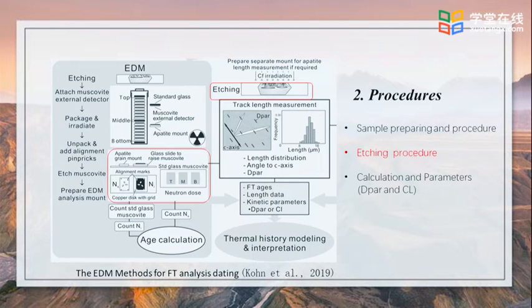After irradiation, the external detector is etched to reveal an induced fission track mirror image corresponding to grains in the mount. Even though this results in a second set of tracks being produced within the grains themselves, these tracks will not be detected because they are not etched after irradiation.